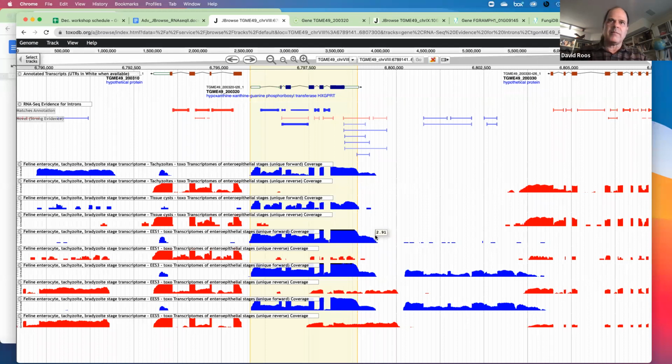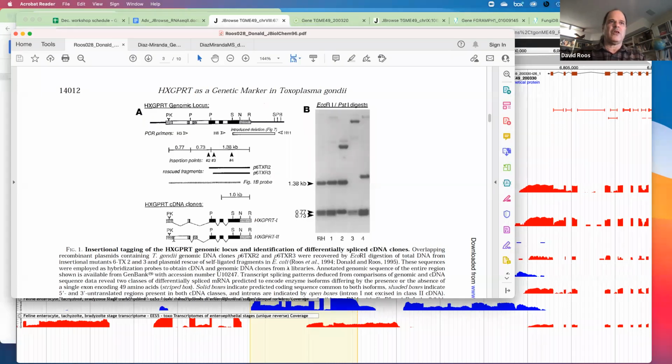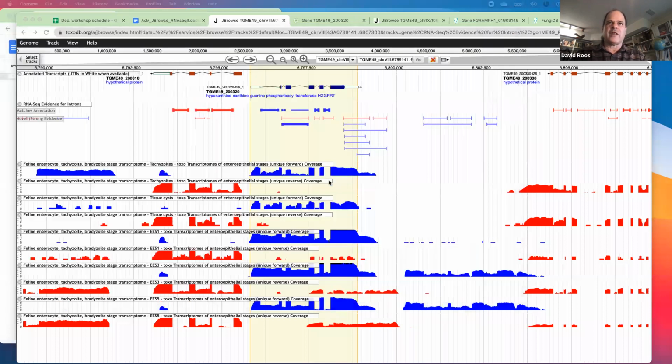Maybe, but in the absence of biological evidence, we'd probably rather not annotate a transcript that is present at only 1% of total message. Now, you may remember that in the original annotation of this gene, it was also noted that there was read-through of this initial intron in the non-coding region. And indeed, we can see evidence for that: while these two introns are very efficiently excised, there's much more abundant transcription through this first intron.